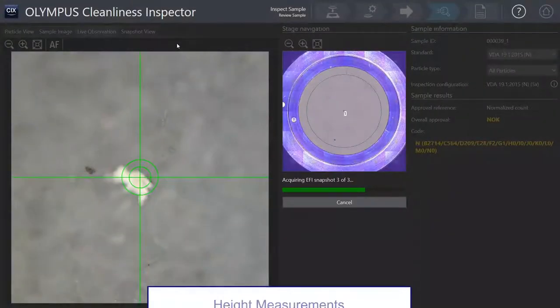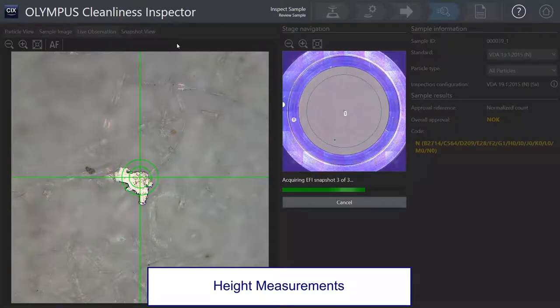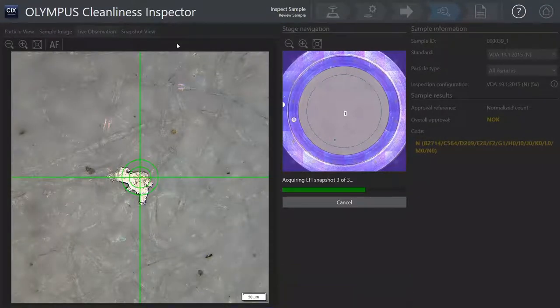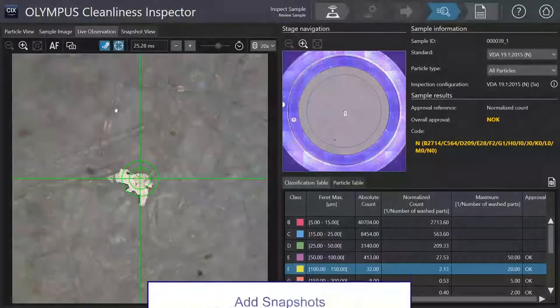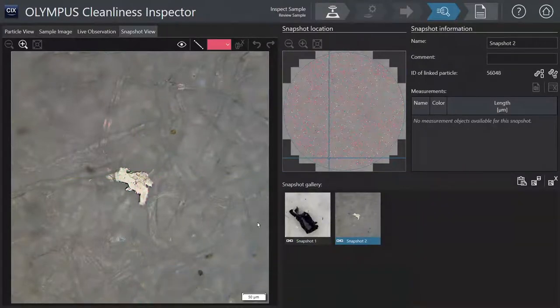For selected particles, height measurement is performed either automatically or manually. Snapshots support the documentation of this live observation.